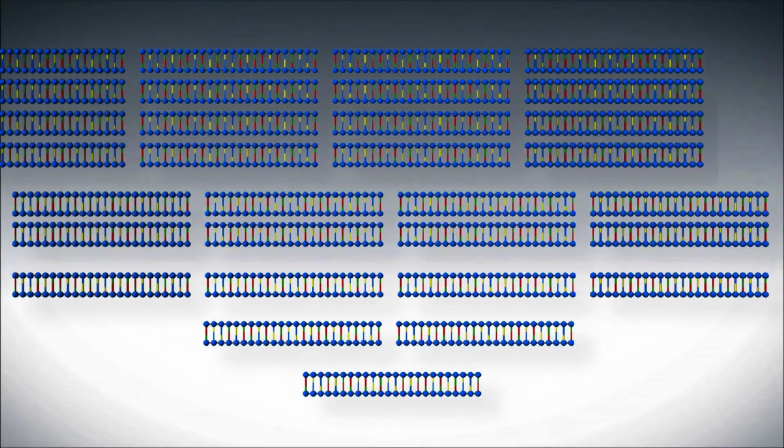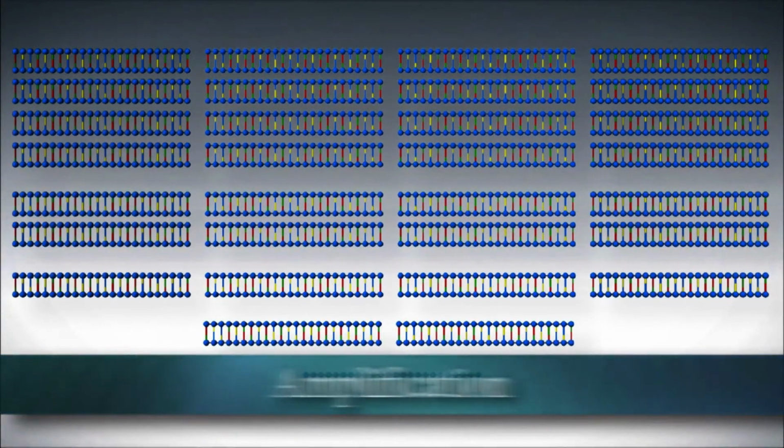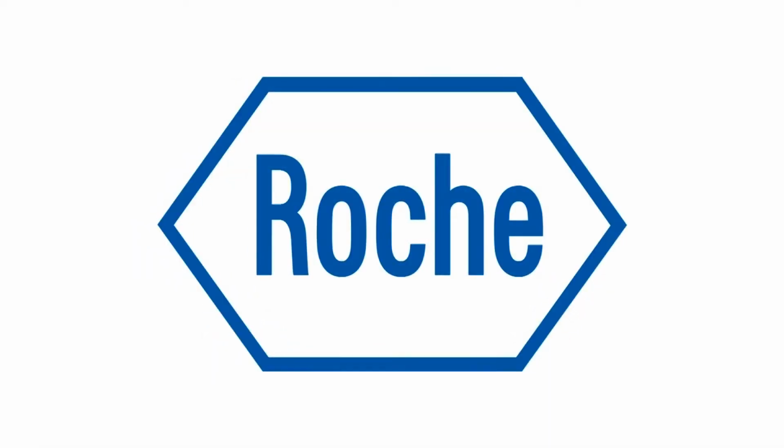The entire cycling process of PCR is automated and can be completed in just a few hours. In a healthcare setting, PCR enables a test that provides clinicians and other healthcare providers with information to guide treatment.